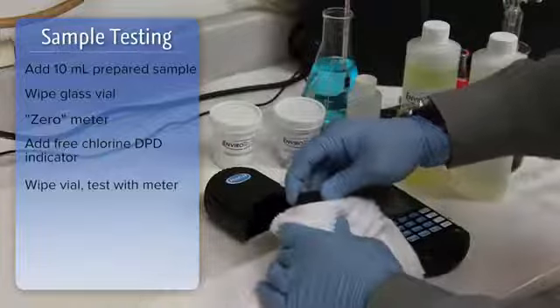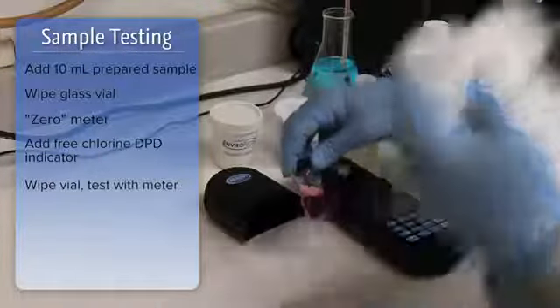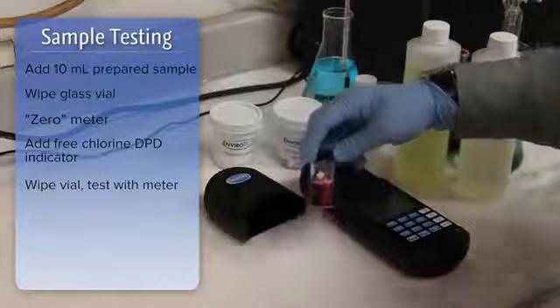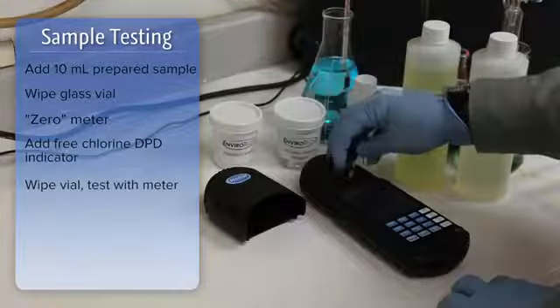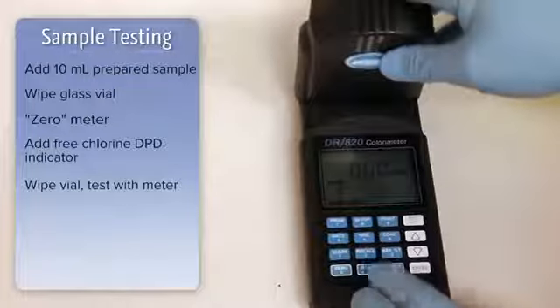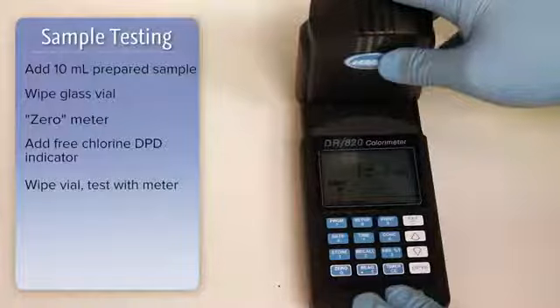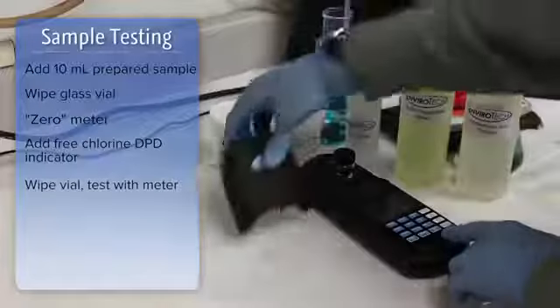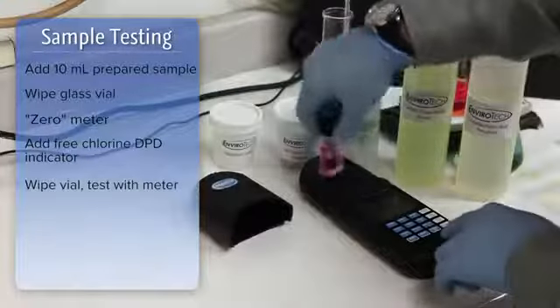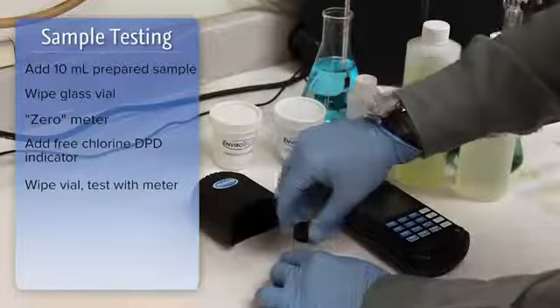Wipe the vial as before. Place back in the colorimeter and press read. Make a note of that number. That number is going to be reflective of the amount of bromine that's in solution.